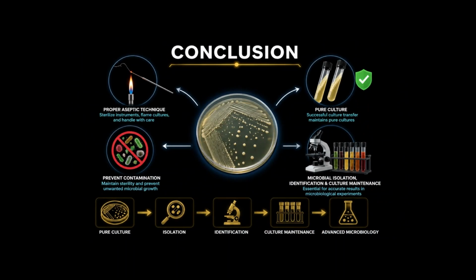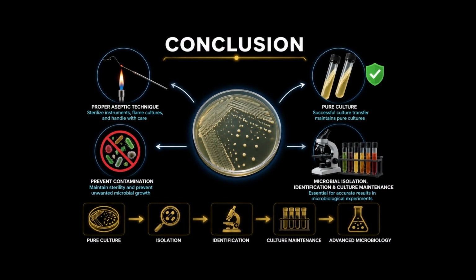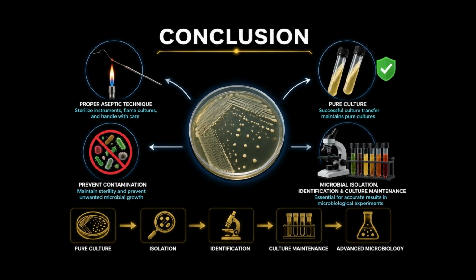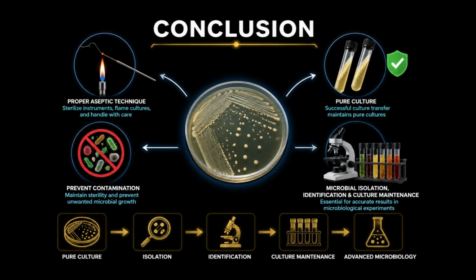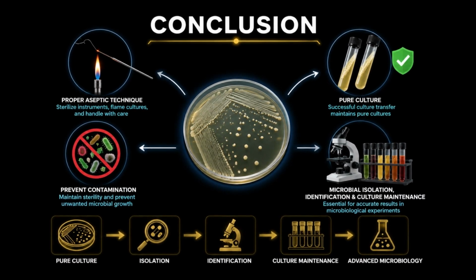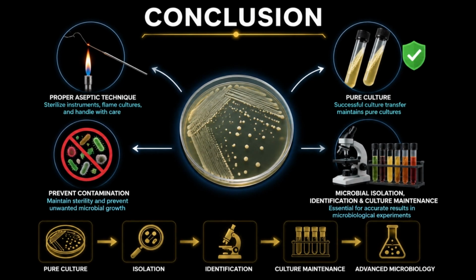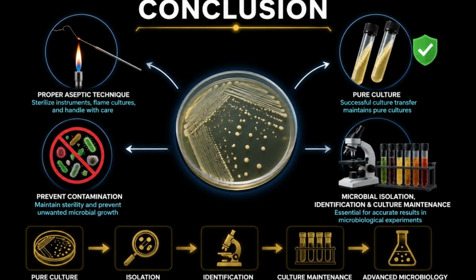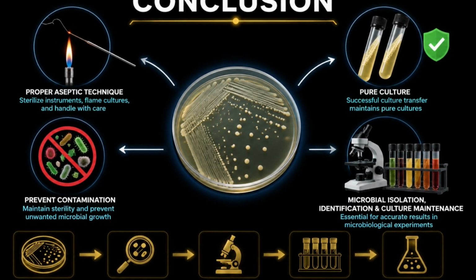In conclusion, the culture transfer technique is one of the most fundamental skills in microbiology laboratories. By following proper aseptic procedures, sterilizing instruments, flaming culture tubes, and handling cultures carefully, we can successfully transfer microorganisms while maintaining pure cultures and preventing contamination. Mastering this technique is essential for microbial isolation, identification, culture maintenance, and many advanced microbiological experiments.